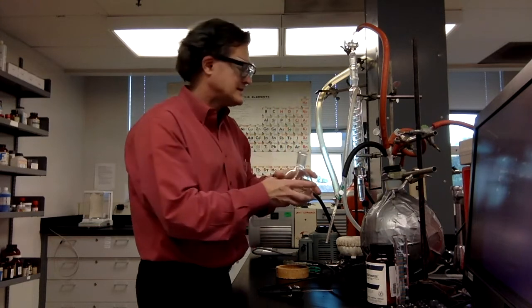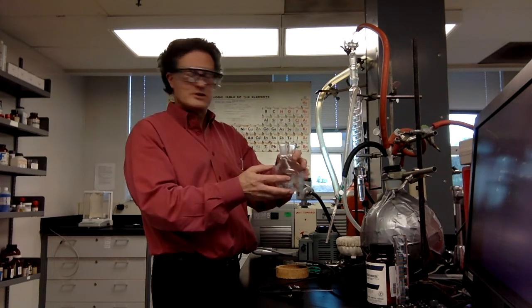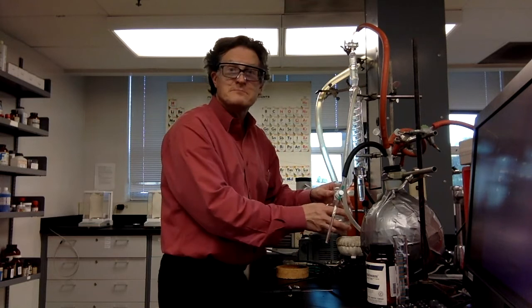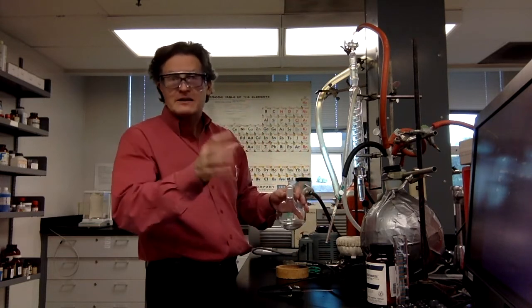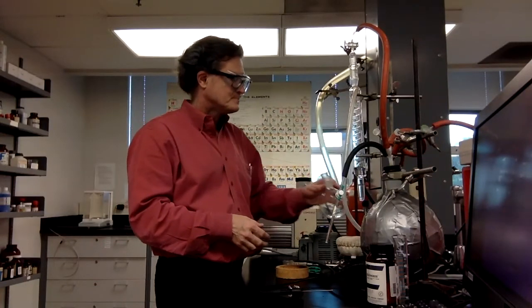Ethanol leaves it nice and clean by itself, so we don't have to wash it any more than that. Then we're going to hook this back up and pump it down. Vacuum systems like to be under vacuum. That'll help clean out the whole system and keep it clean. All right, so there you go. That is the determination of the enthalpy of vaporization, the equilibrium vapor pressure.